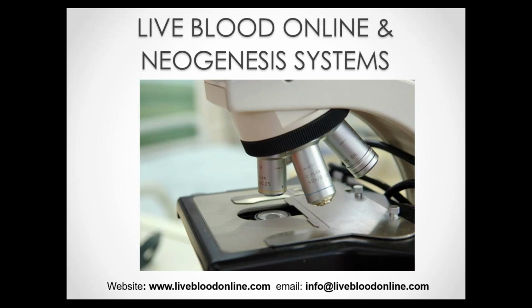Now, there is, of course, a large part of blood analysis that is based purely on standard normal hematology. As you know, that information has been researched many years ago, and there really is no need to subject that information to any further research. However, because of the differences between live and stained blood samples, there are many other signs and indications that don't form part of hematology, and there have been some small-scale studies that were done, and we can definitely go through those in more detail in another webinar.